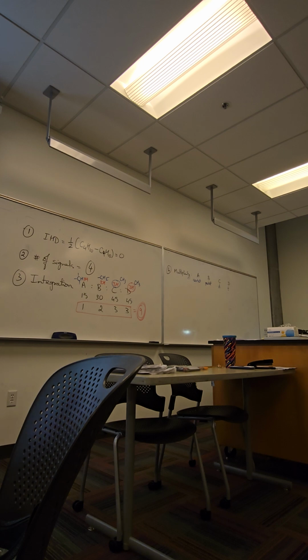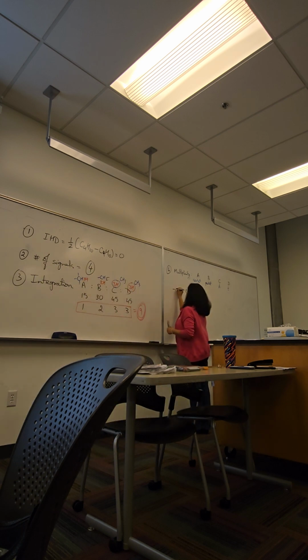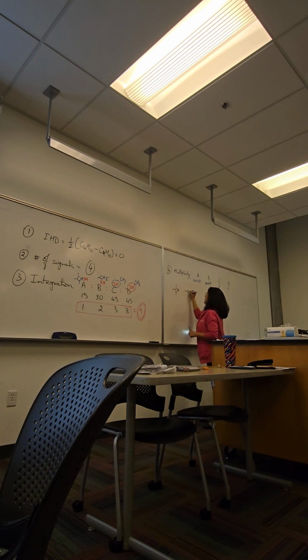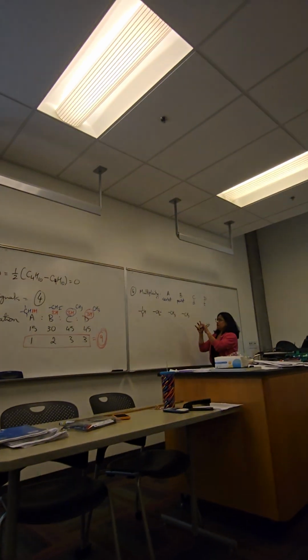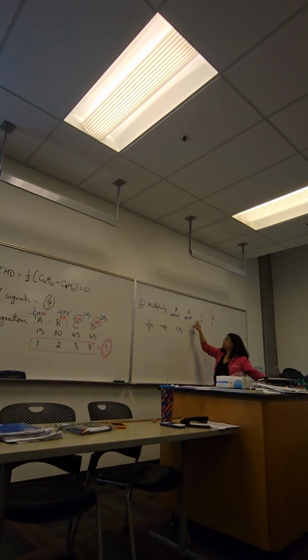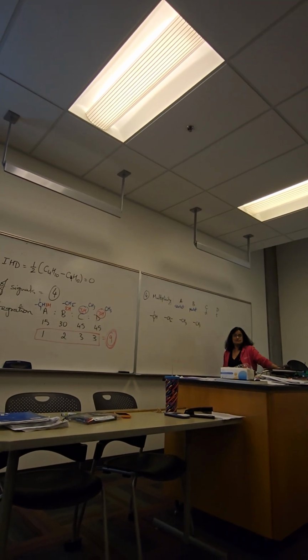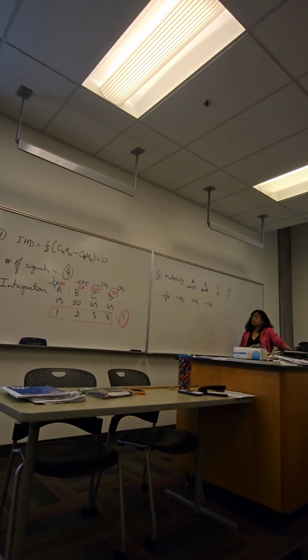So we have 4 pieces here: CH with 3 open bonds, CH2 with 2 open, and 1 CH3 and another CH3. How do we put these 4 pieces together so we can get a triplet and a doublet and a pentet and a sextet? Well, 2 CH3 in the sextet? I don't know. The CH.